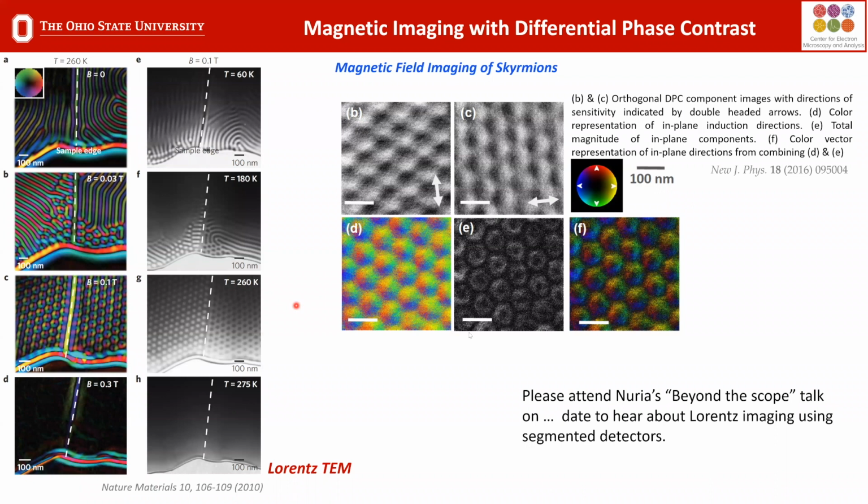So what we're looking at now is trying to figure out, can you flip these small domains, make them smaller, but could you write a 0 and a 1 to them? Could these become the magnetic domains by which we have memory storage? So this is a very applicable technique and something that people in the memory storage world and in some of the microelectronics worlds really need to help push forward the next generation of devices.